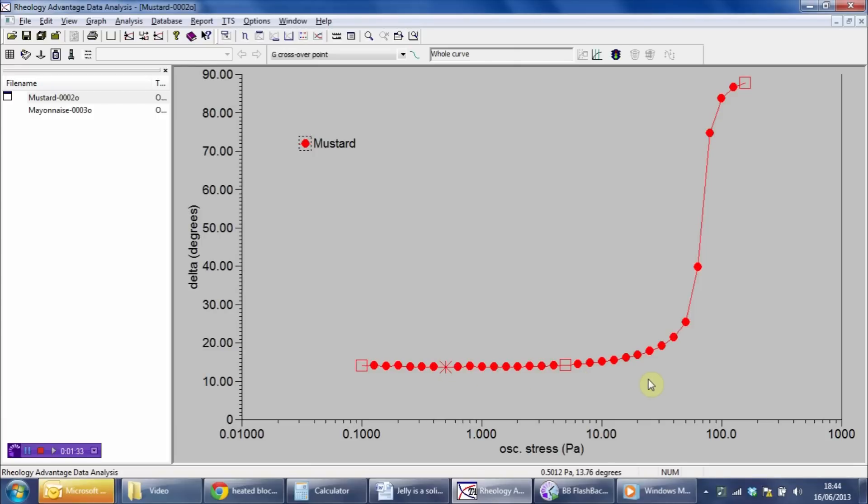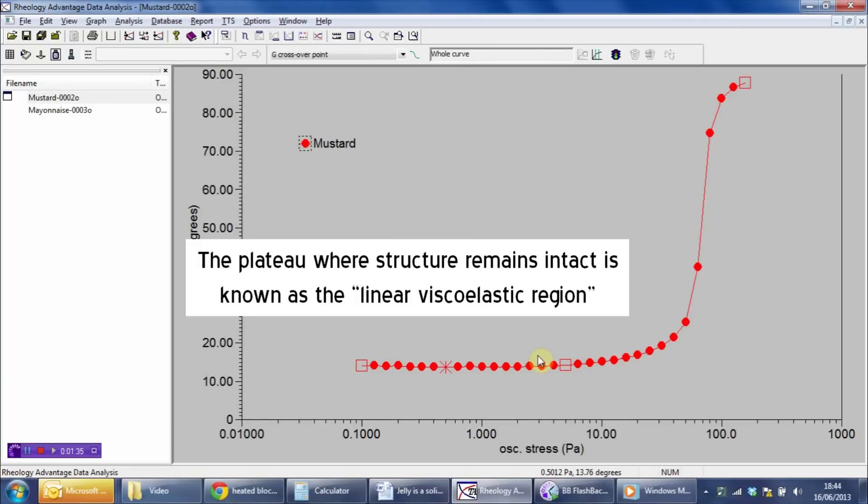This tells us that the mustard has an intact elastic structure at those low stresses, but as the stress rises, we can see the ongoing yield. The structure breaks up, and the phase angle heads up towards 90 degrees.